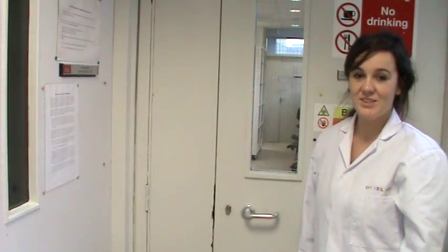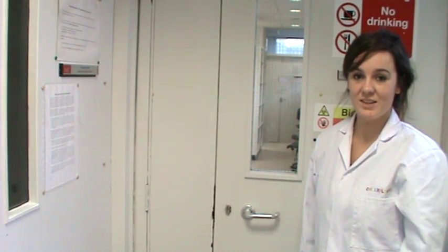I am now here at Elaine Dunleavy's lab. Elaine is a researcher here in NUI Galway. Elaine is going to tell us a little bit more about the applications of extracted DNA.